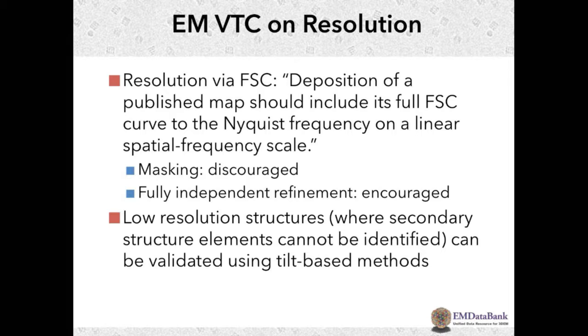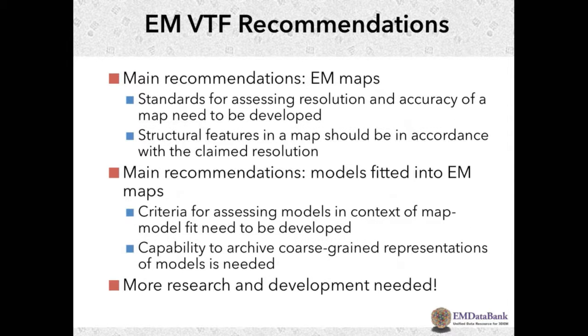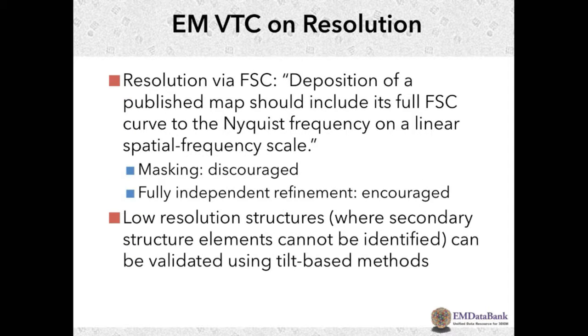Yeah, so just to go back, structural features in a map should be in accordance with the claimed resolution. And so for that reason, if you can see secondary structure, or if you can see individual residues, then you know you're on the right track, right? You know you have something. You know that map I showed you before, which was very problematic. You couldn't see any secondary structure.